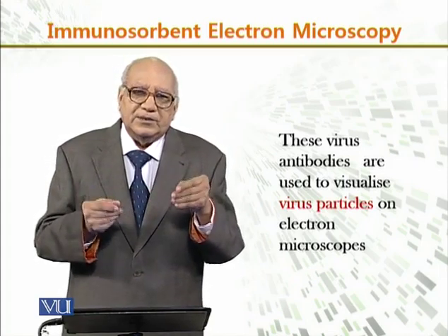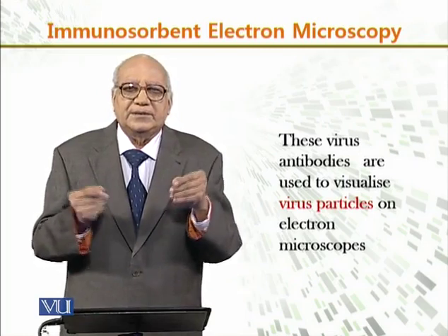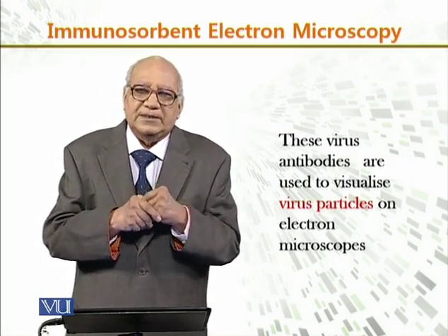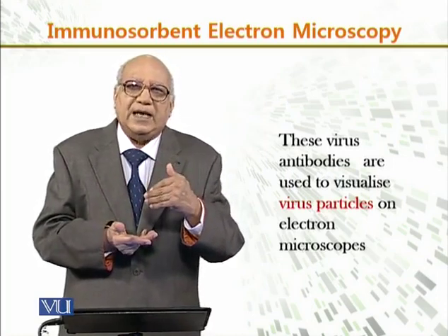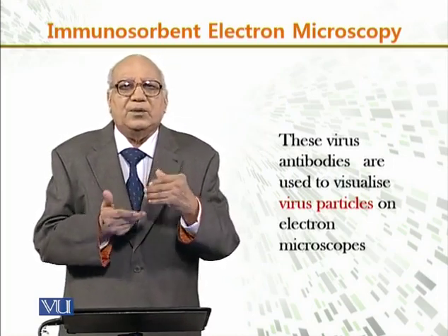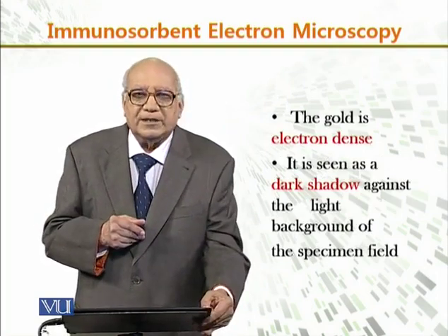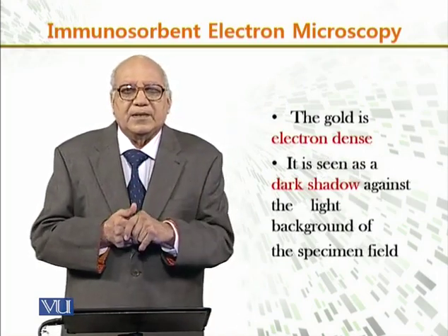You see, once we conjugate the antibodies on the gold particle, then we can visualize. Actually, we can see the virus particles on an electron microscope.